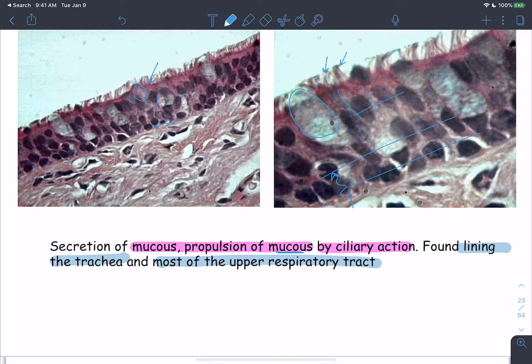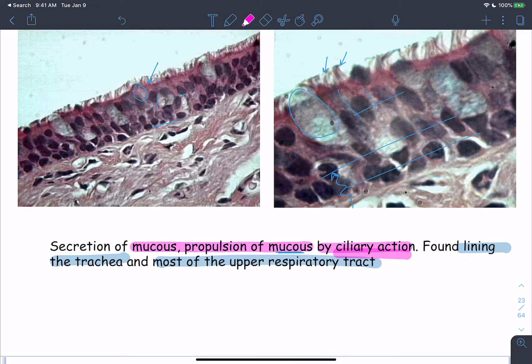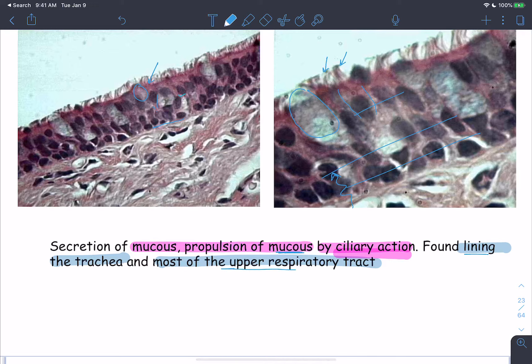On top of the apical cells, there are cilia — hair-like projections — responsible for propelling the mucus released from the goblet cells. We mainly find this pseudostratified columnar ciliated epithelium in most of the upper respiratory tract and the trachea.